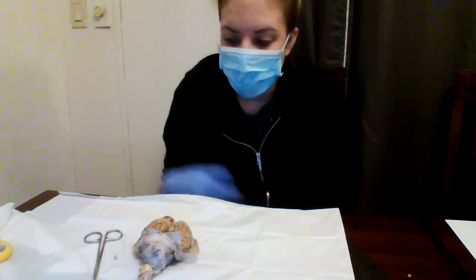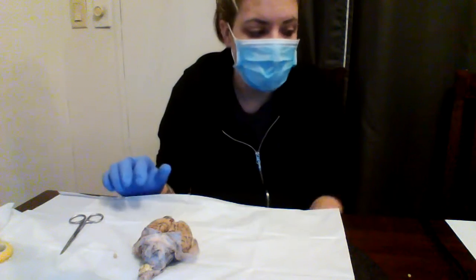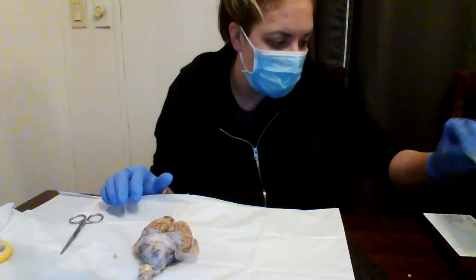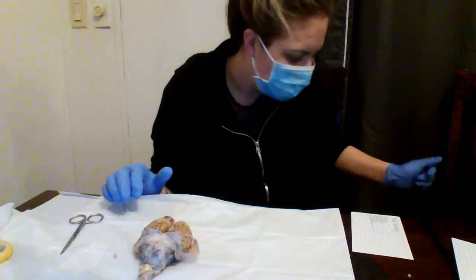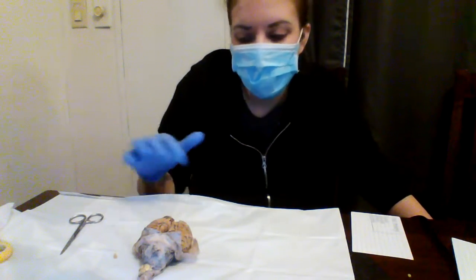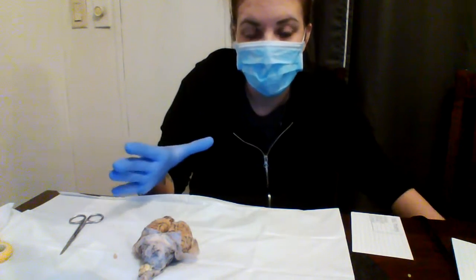This is the sheep brain video, the dissection of the sheep brain. First, I want to start off with the gross anatomy. The gross anatomy, well, first of all, the sheep brain is a lot longer than the human brain.